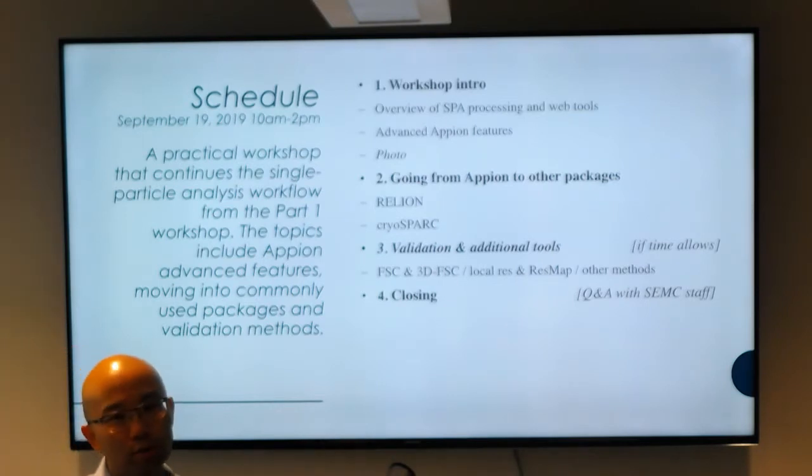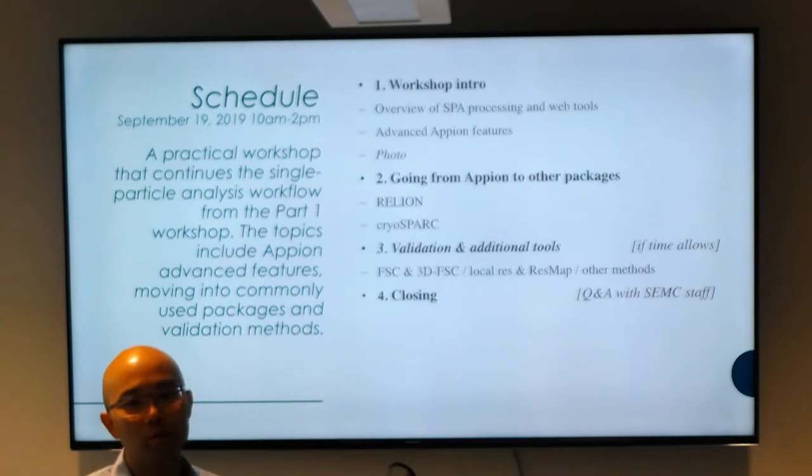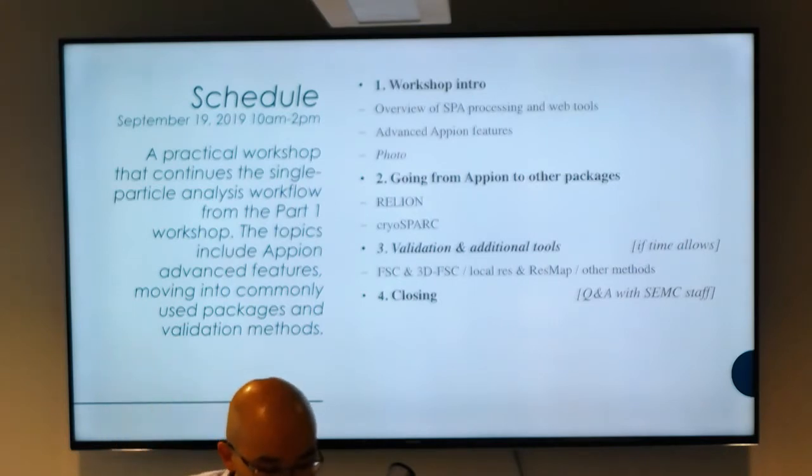We also have tutorial data sets. We have more than one, so we have a tutorial data set to start you off with, but if you go through that tutorial really quickly, we'll have other data sets for you to try.